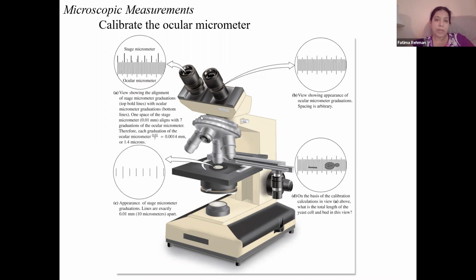Okay, now going underneath, what is this revolving piece called? We have this rotating piece underneath the ocular lenses. What is that called, rather? Yep, it's the revolving nose piece, and it contains what? So there are four different lenses. What are they called? The objective lenses. That's right.